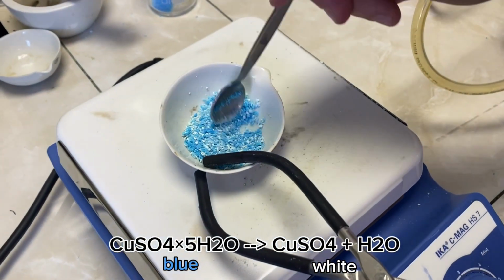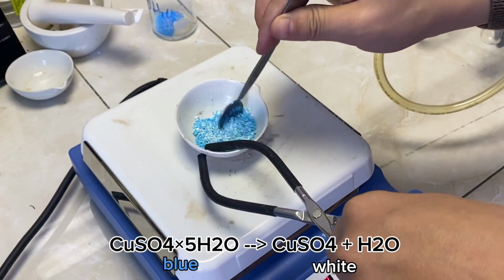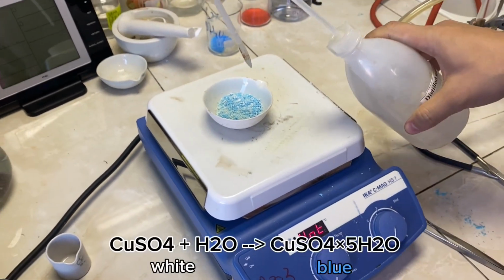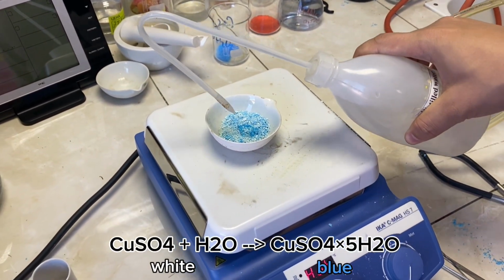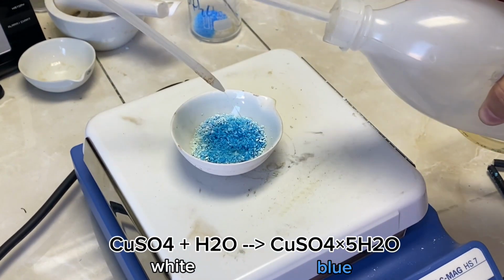After 2 minutes, you will find that the color will change to white because of the formation of anhydrous copper sulfate. In order to reverse the process, you need to turn off the heater and add some water. And in excess of water, you will expect formation of copper sulfate pentahydrate, which is blue. So the color will change back to blue.